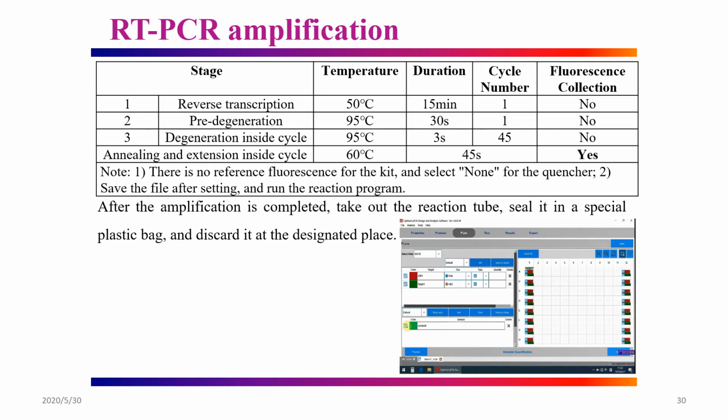If we need to add some negative and positive controls, then we can define the type of well. For example, select the first well to change the type. Select from the Type drop-down list to represent the negative control, and then select the last well. We expand the Type drop-down list, then select plus in the list to represent the positive control.